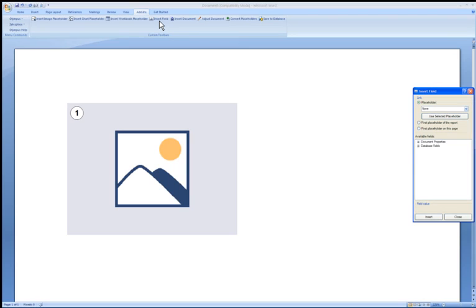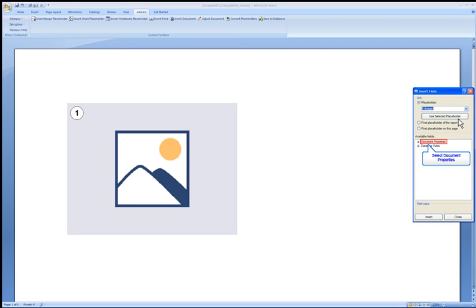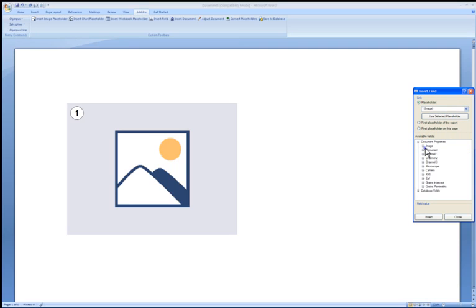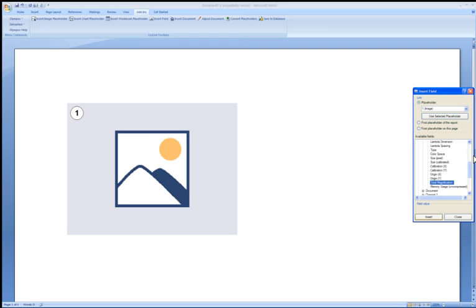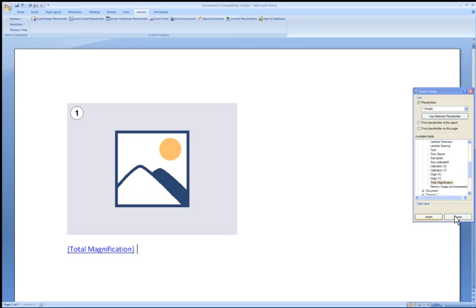Now the Insert Field tool window opens. You can select which placeholder the field will be associated with from the drop-down menu. Let's select placeholder 1. Now you can select from many different fields from either the document or database. Choose a field from the image list. Let's select total magnification. By clicking the Insert button, it will place the total magnification field into the document. Now we can see the field below the image.